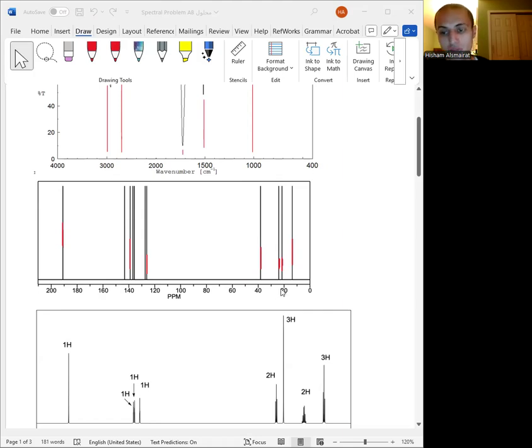It's CH2 type 3. Those two downfield aliphatic carbons fit a benzylic CH2, which is from 35 to 40, and the middle CH2, 20 to 30, of a straight chain.